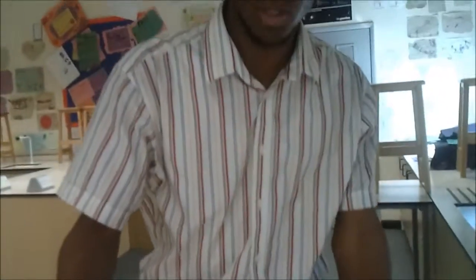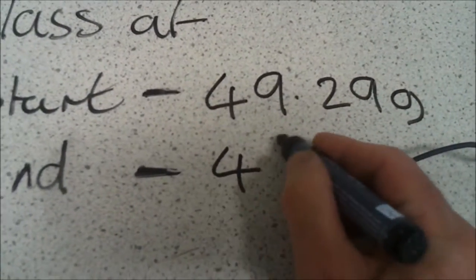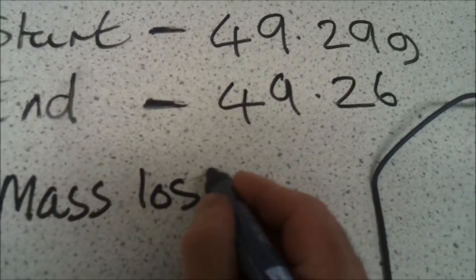Okay, so we're going to weigh this gently. And now it's actually 49.26 grams. So it's going down. It's 0.03 grams. OK, so we're checking the mass difference now.